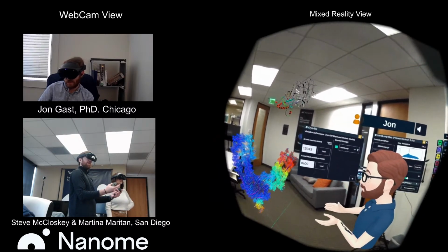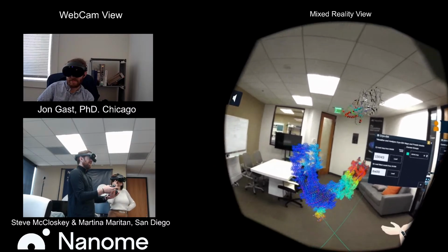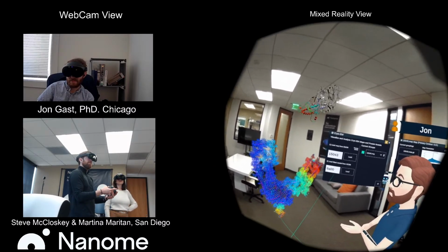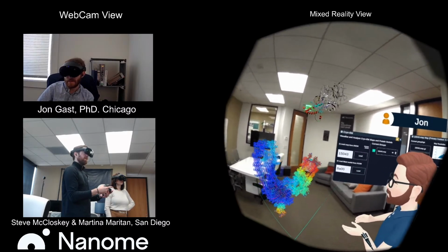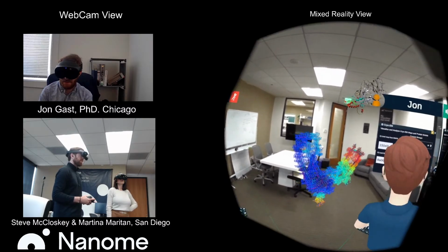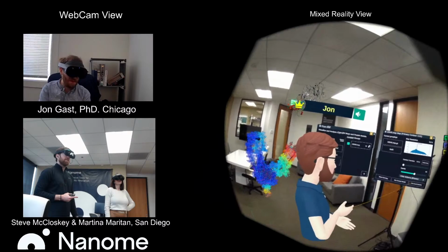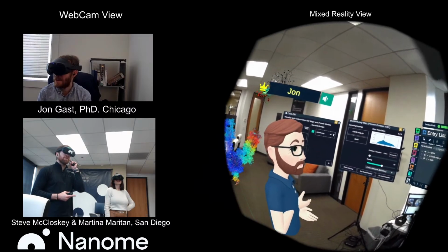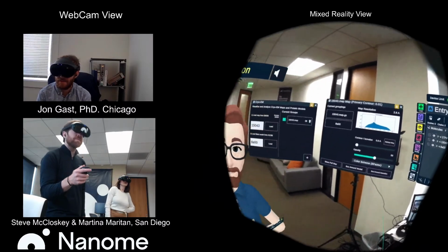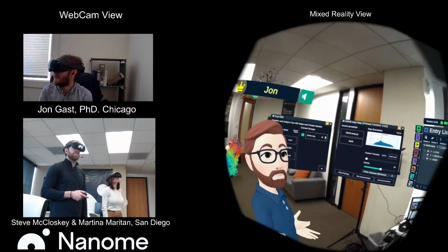If we had something maybe very large, even like full virus maps, things like that, you would probably want more juice from a GPU-powered desktop or laptop. Yeah, the good thing is, something our engineer Mike, credit to Mike here, one of the things about box around selection that's just really fantastic is that for some of these larger maps, you might not necessarily need to see the whole thing all the time.